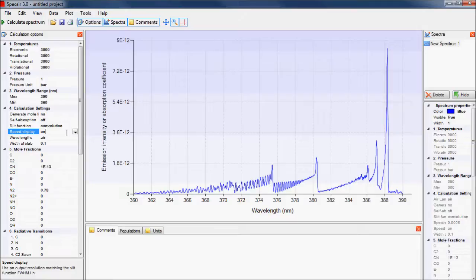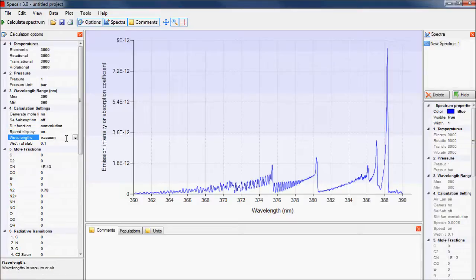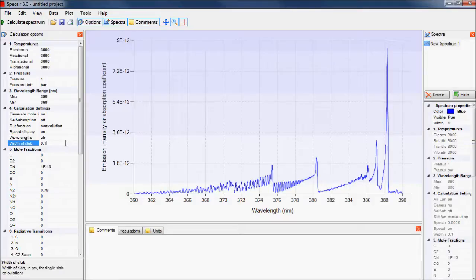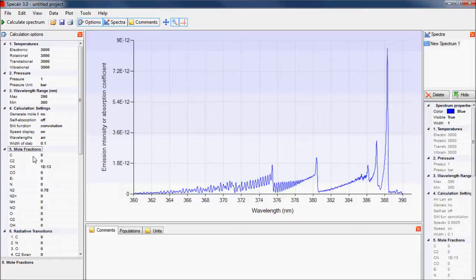The wavelength values can be those in air or vacuum, and the final calculation option specifies the width of the plasma in centimeters. The mole fractions describe the gas composition. All common species in air can be selected, and the values should be between 0 and 1.